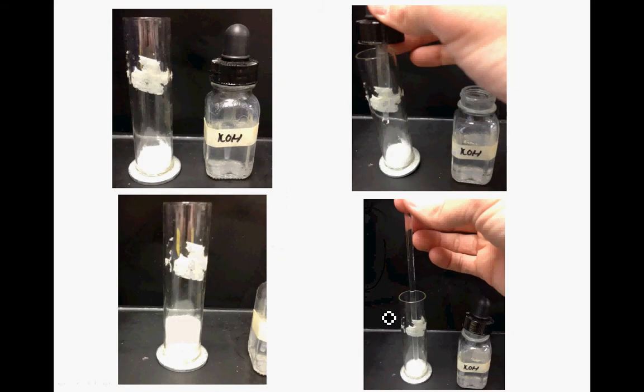So first things first, here's what's going to happen. Step number one, you're going to take your chamber and put some absorbent cotton in the bottom. This is about one finger width of absorbent cotton. It's highly quantitative. So one finger's worth of absorbent cotton, stuff it into the bottom of that chamber.